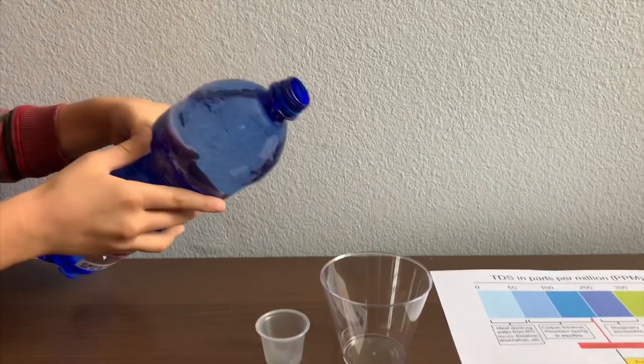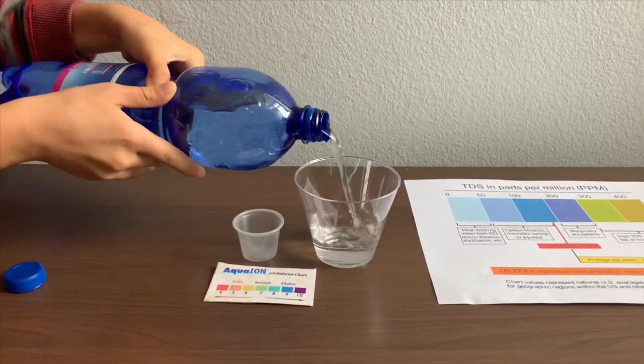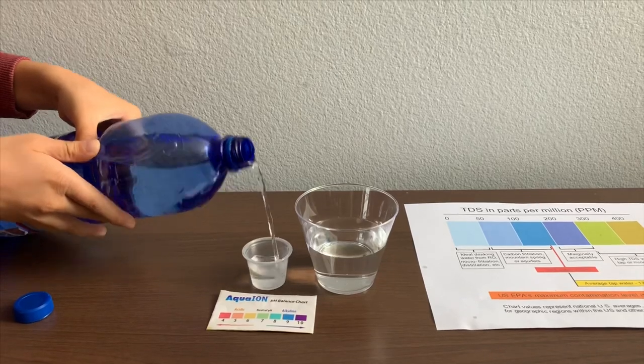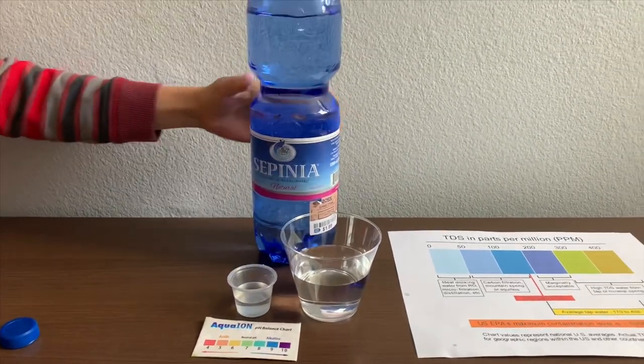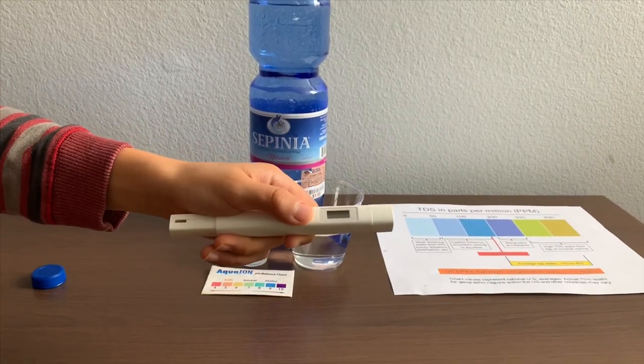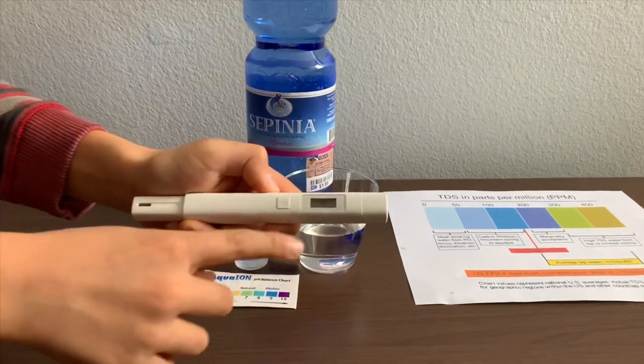Let's pour some water in. First, let's test the TDS level. If you want to buy this TDS tester, check the link down below.